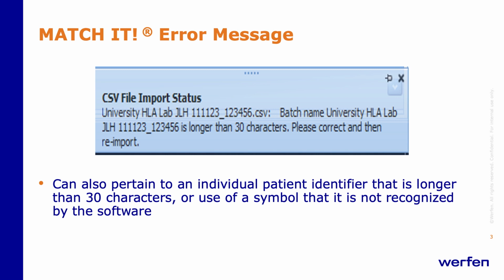This can also pertain to an individual patient identifier, like one of the patient names in your batch. If it's longer than 30 characters, the entire file will not successfully import. Or if you use a symbol that's not recognized by the software. Did you think that your run would be lost and you'd have to repeat the whole thing? That would be very frustrating indeed.